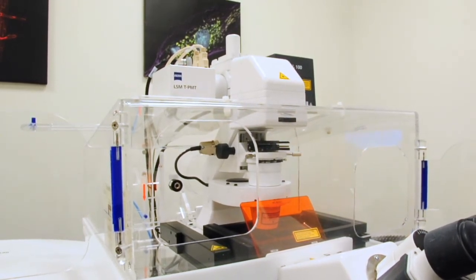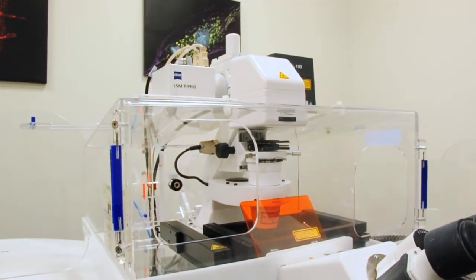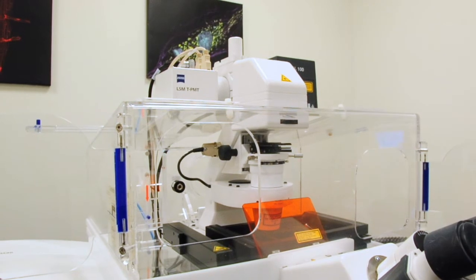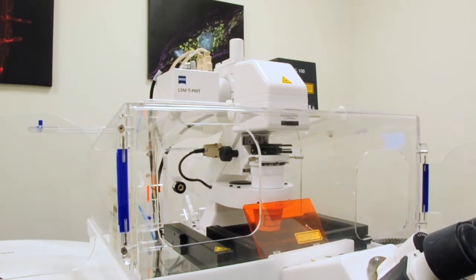I find this very helpful in seeing the health of the cells. Are they spread out like they should be or are they rounded up? As well as things like plants, we can easily see cell walls using this.